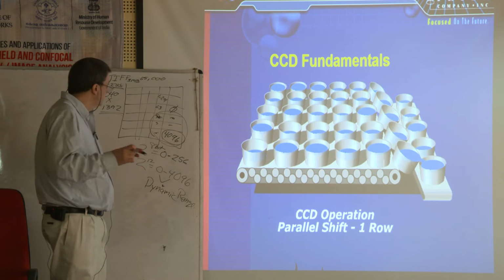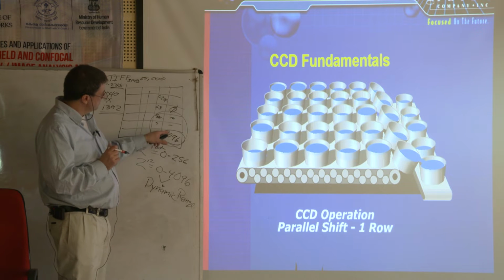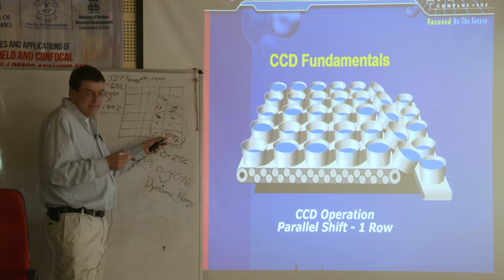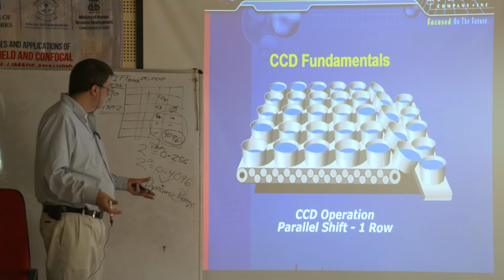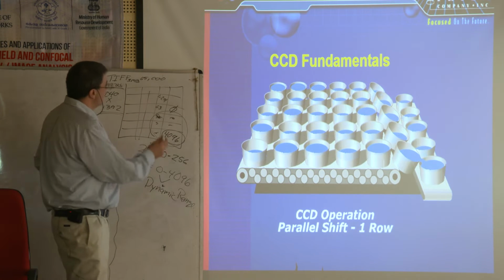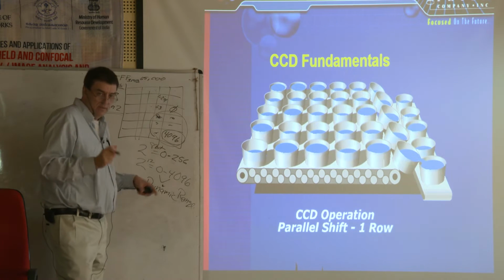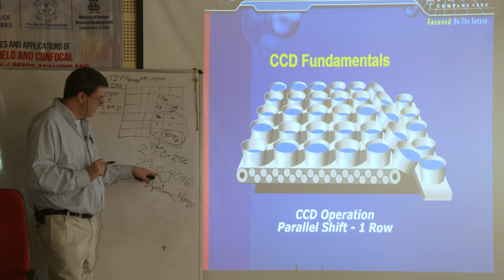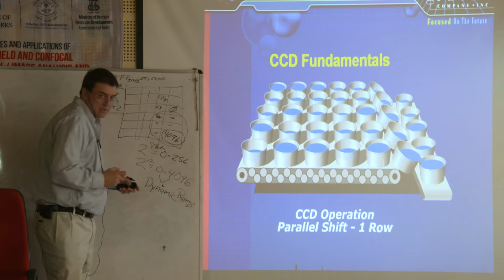Okay, that's bad sometimes, but sometimes it's not bad. Okay, we have MetaMorph. I'll show you some of this stuff too. But the reason this is bad is because, okay, if I've overwhelmed the system here, I can't measure anymore. I don't know how many, you know, there might be 8,000, but I can't measure it because I've overwhelmed the system. So I've exceeded the buckets. I filled the buckets too high. Okay, but if I have a million pixels to work with, and I have two or three pixels, or maybe five pixels that saturate, there's something that tells me that I've used the full dynamic range of the camera, because I've used enough light to have a few pixels go all the way. So I know I've used this range. Okay, and this is what you're after.